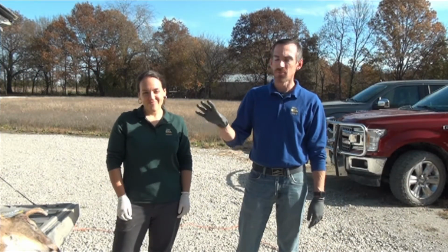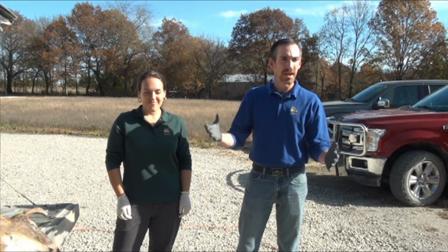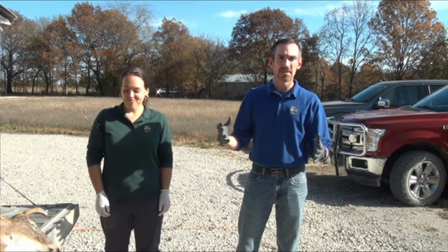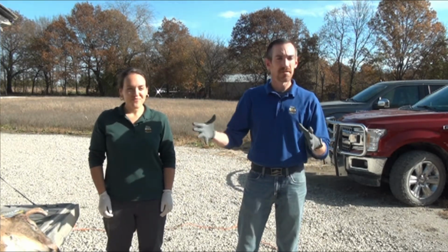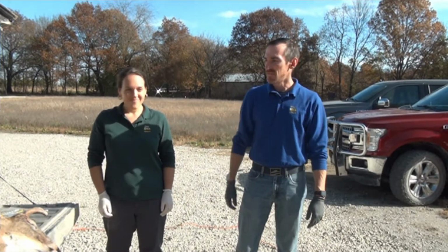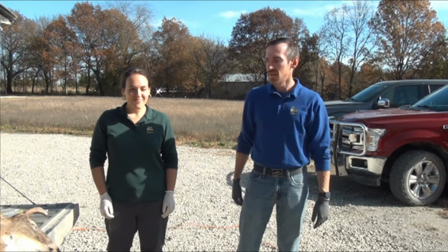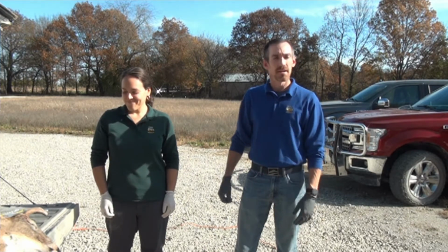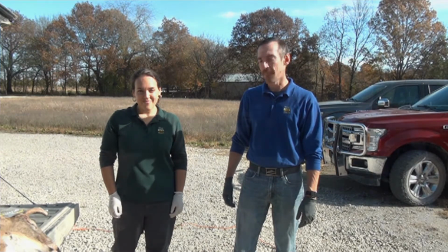This is actually a roadkill deer that we've collected for the purpose of the video today, but we're going to walk through this process as if this was a deer that was harvested by you in the field, and then we can show you what this looks like. So again, if this deer were harvested in the field, it would likely be field dressed at this point, we would have a tag on the animal, and then the next step would be to pull this tissue sample for chronic wasting disease testing. So we're going to walk you through that now.